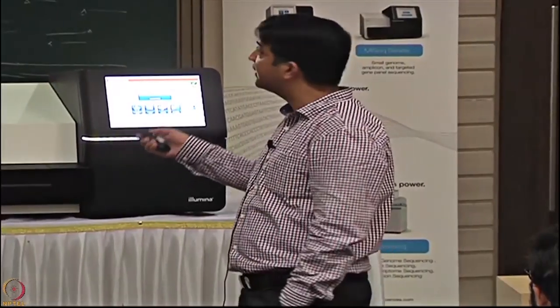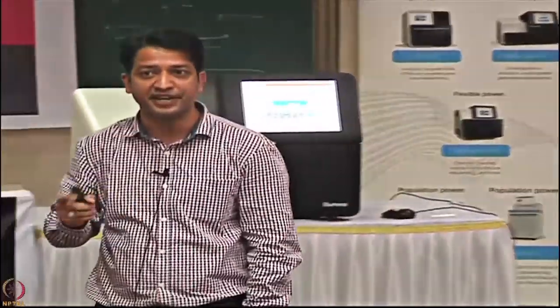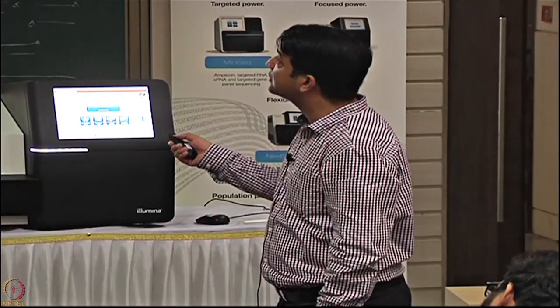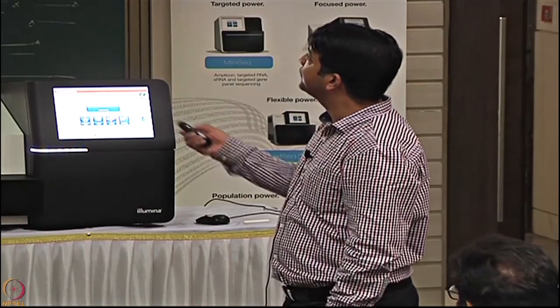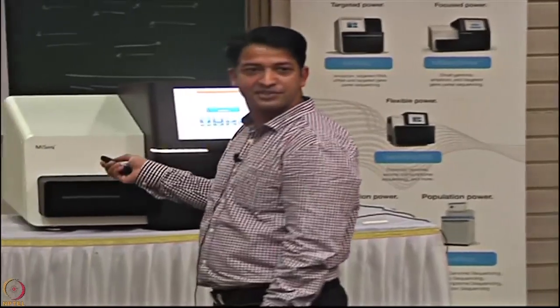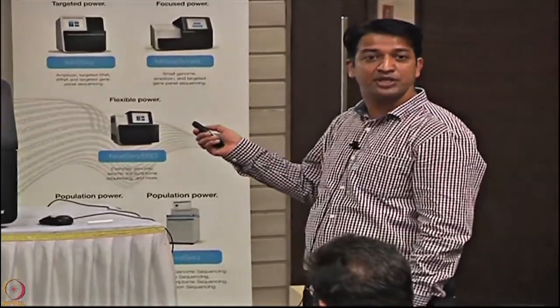Those are detected. Then we denature this product, the product of read one sequencing primer, and we are set to go for paired-end sequencing. We will denature it, and again we will deblock this end. Clear? Again, it will flip because we have deblocked the end, and again you can see multiple clusters will be generated. But this time, we are going to cleave away the forward strand.